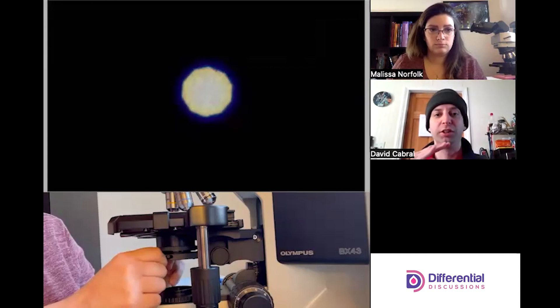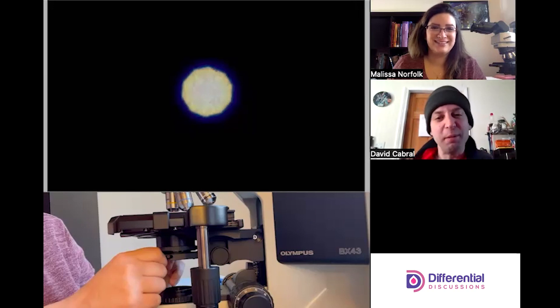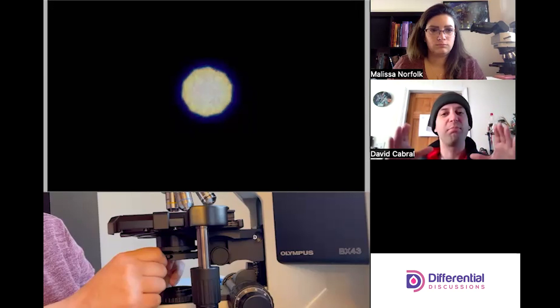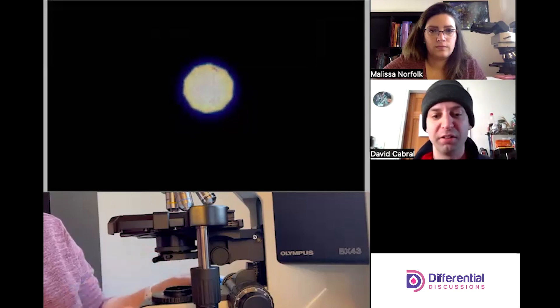This will definitely affect the sharpness of the final image if your Kohler is way off to the left and you're operating with the diaphragm much too open—too much light going in there. It's inefficient and will give a blurrier image. These set screws take a little bit of practice, so be patient with the adjustments as you go. You might find that tightening them moves it in a direction you might not expect, so just work on one axis at a time and slowly kind of dial it in. As I get it closer to the center I start to open that light up more and it becomes easier to see the small degrees to which you might be off.